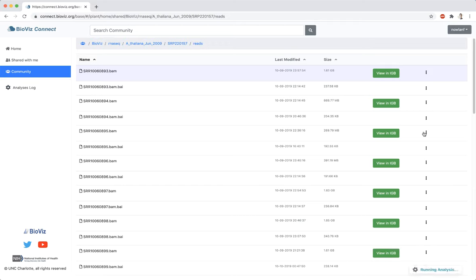Analyses are submitted to be run on the cloud. The amount of time they take to complete depends on the analysis selected, the size of the file, and how many other users are running analyses.